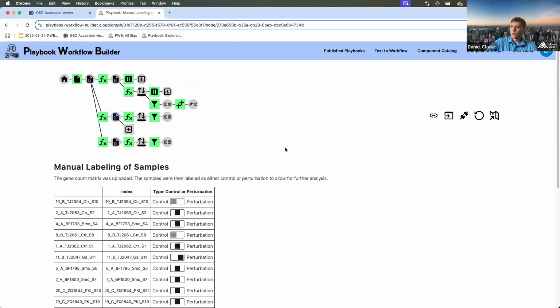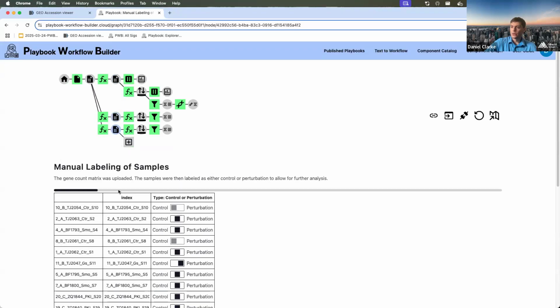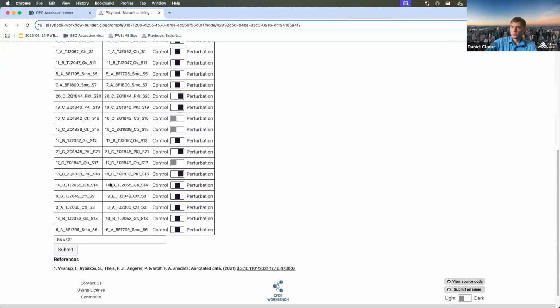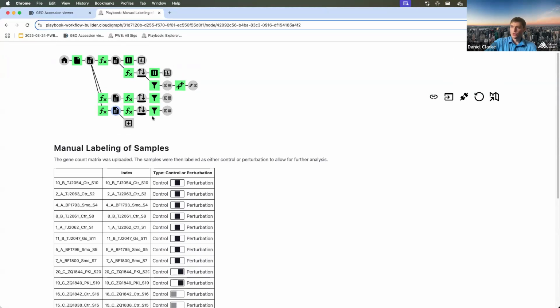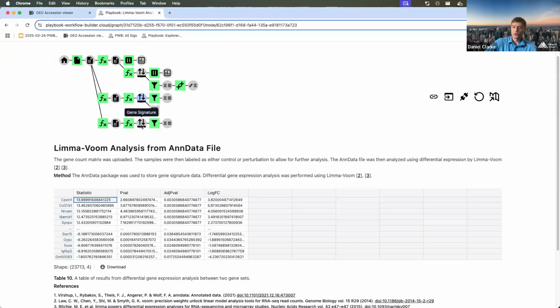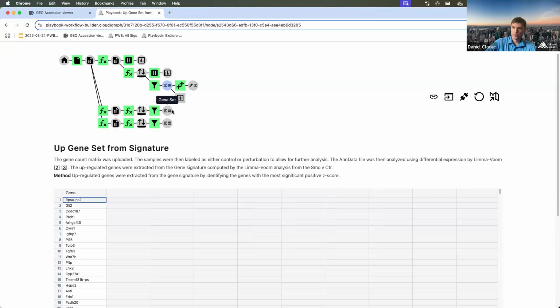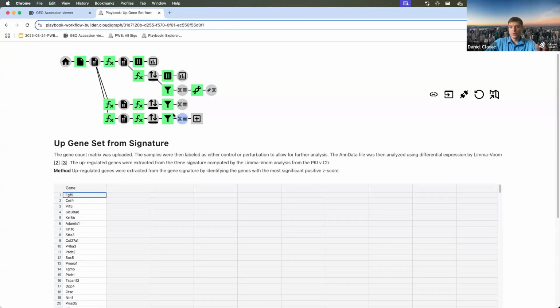And then we also have the other C samples. So these two different samples, or two different mouse models, we have differential expression produced for both of them. And then finally, we have gene sets from all three of these. So what we can now do is a form of consensus.